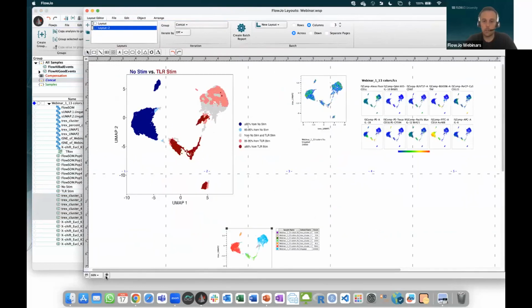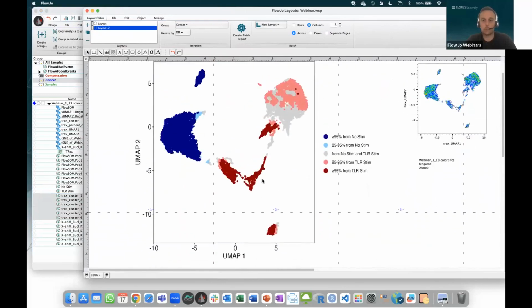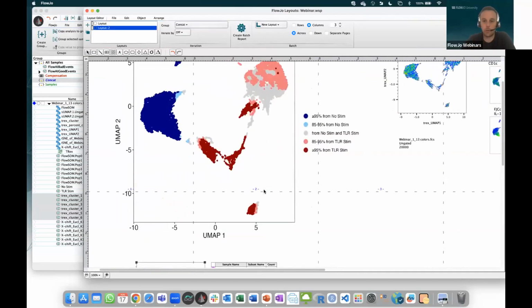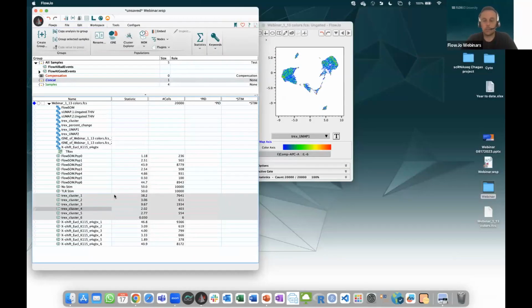Okay. And in this example, it was really a drastic difference between the two conditions. So of course, you find almost every cell present there, but for you, it may be just a few clusters, as we saw. Okay. All right, but those are just numbered clusters 1, 2, 3, 4, 5, 6. We just want to name those with a real name.